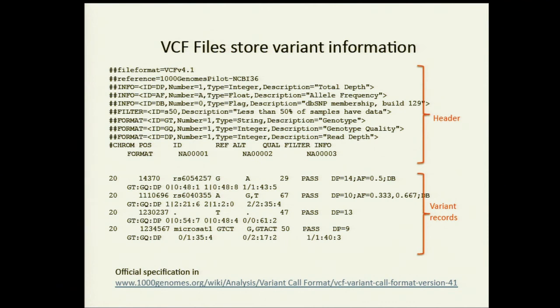That means there are 2 chromosomes because we're diploid in humans. And 0 represents the first allele, G. So this sample is GG. She is the reference, homozygous reference. GQ is some sort of quality, which we don't discuss now. And the DP is also the depth. So she has 1 read in the sample, and she's homozygous reference. So it's not a very confident call. You only have 1 read that overlapped that position for that sample, and we're saying, well, that was a reference read. We just think she's reference. We don't see any evidence for a SNP. So not a very confident genotype for this sample.